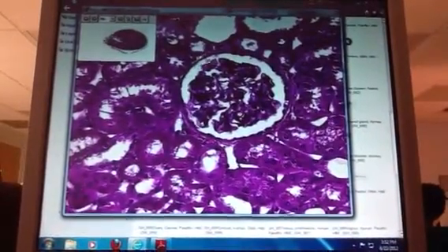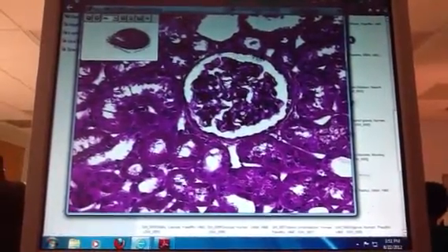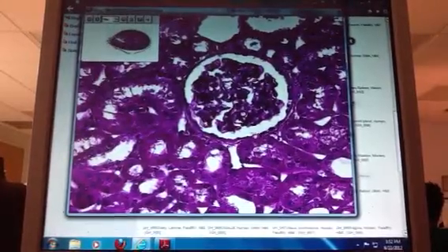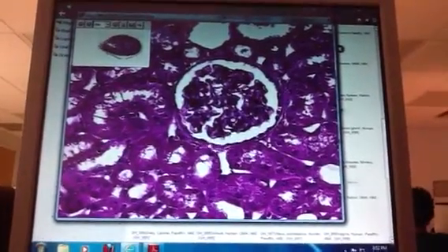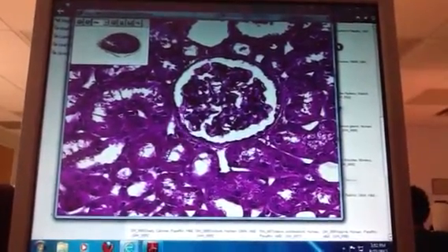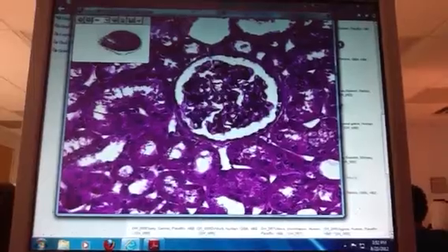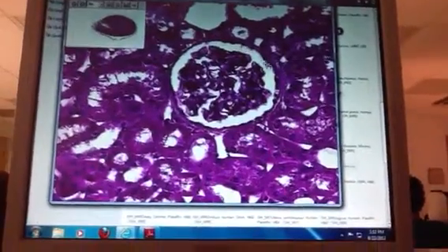This is your simple squamous epithelium. One single layer, flattened nuclei — simple squamous.